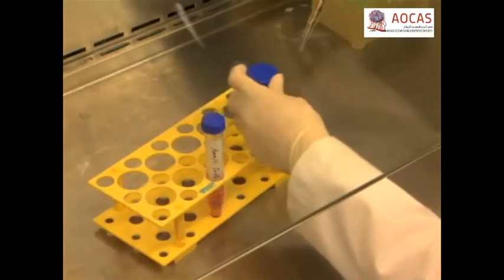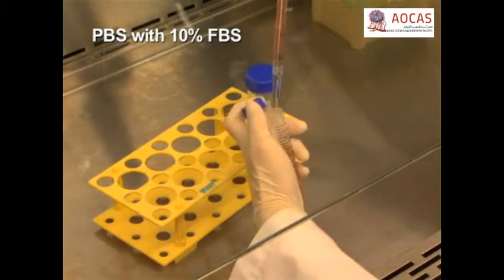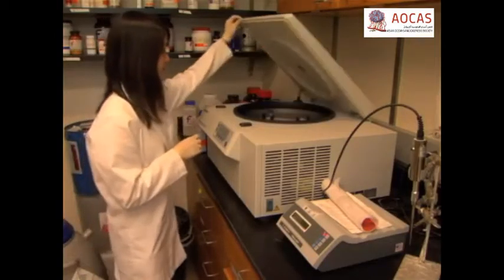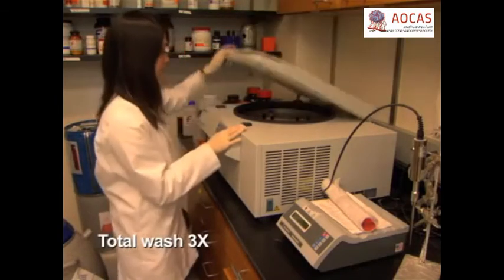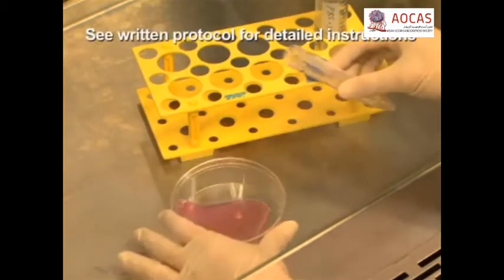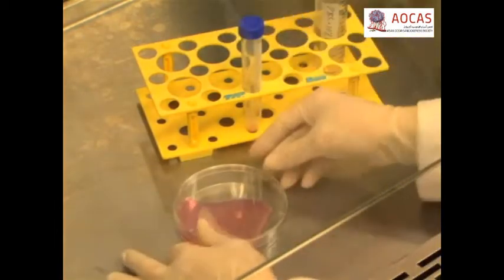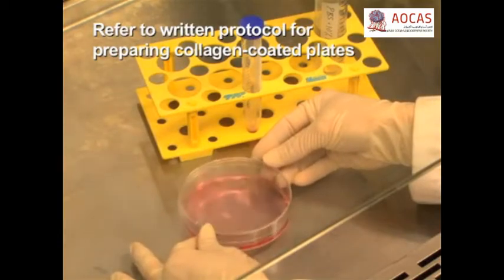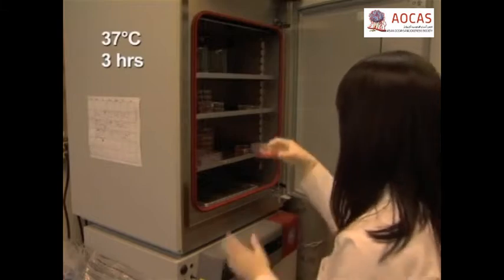Add 5 milliliters of PBS containing 10% fetal bovine serum to each sample and centrifuge at 1,500 RPM for 5 minutes at 4 degrees Celsius. Repeat this wash two more times. Re-suspend the cell pellet in 10 milliliters of DMEM containing 10% FBS and antibiotics and plate in 10-centimeter dishes coated with collagen type 1. Incubate the cells at 37 degrees Celsius for 3 hours.